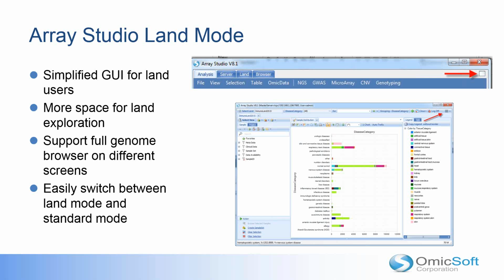We think that we want to work with users closely to improve these GWAS modules. But then let's actually move on to something that's not so variant or genetic centric.